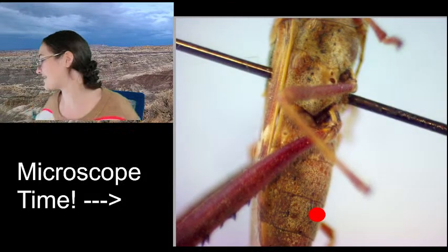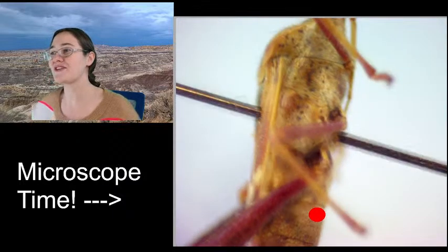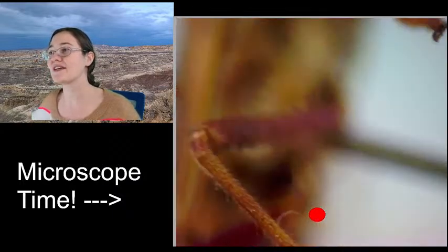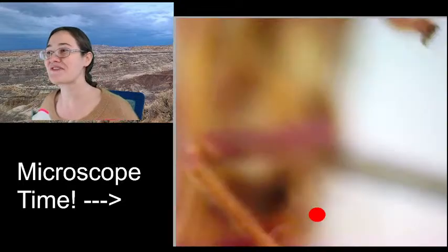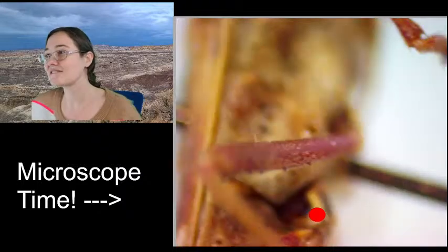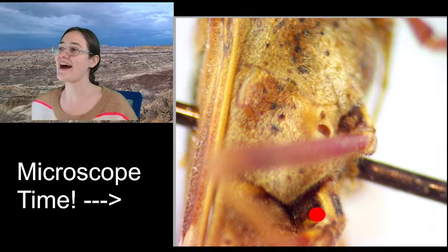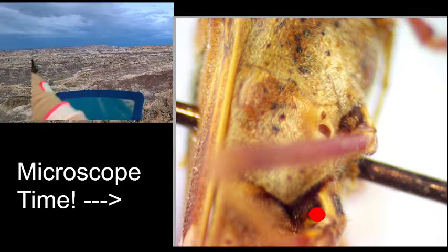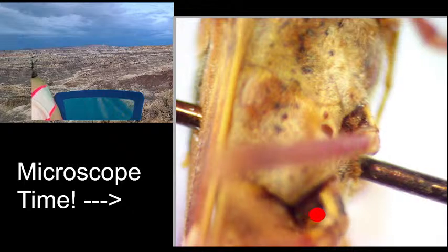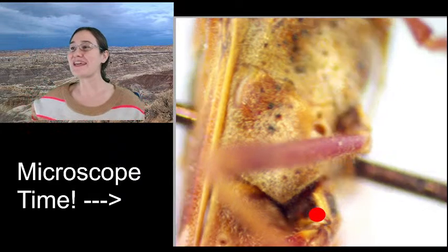I think that's it. It's normally between the second and third pairs of legs. There is something I'm looking for to show you. Yes. Aha. I am 90% sure that is our bug's stink gland. So, yes.